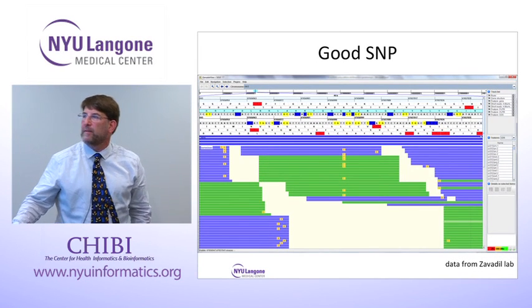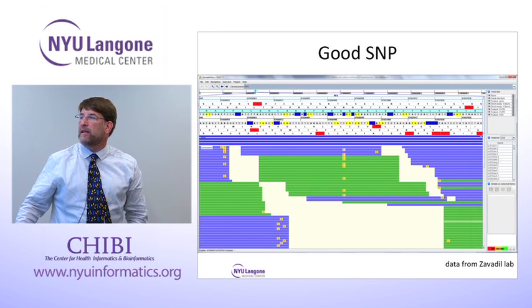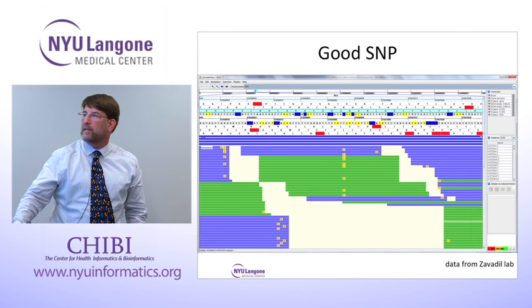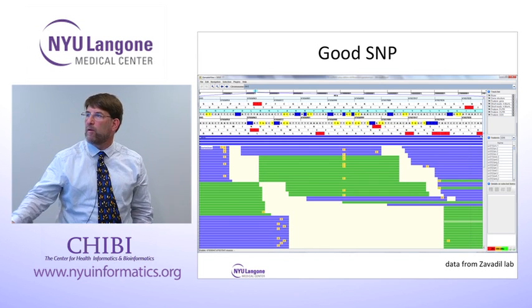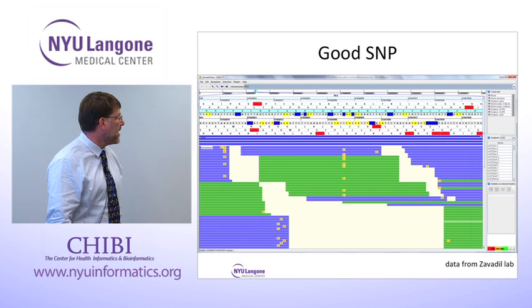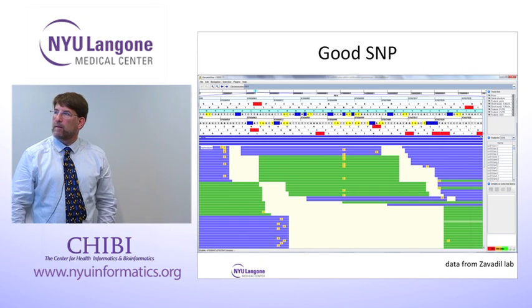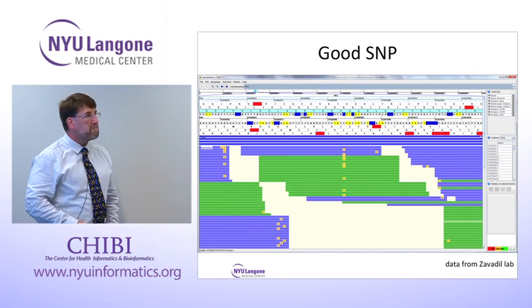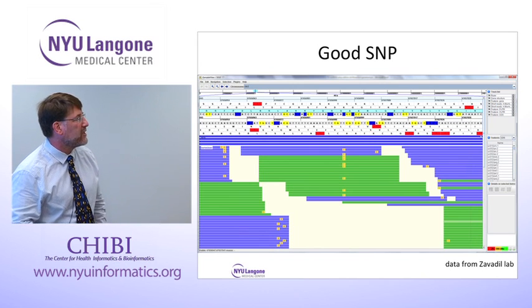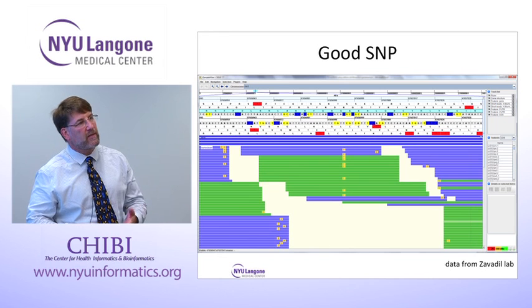Here's one that we think is real, a SNP that was detected by RNA-seq. The reason we think it's real, it's showing up in many reads that start in different positions. And it's showing up in good quality reads that don't have other mismatches. You expect them to be 50-50 when we describe SNPs? 50-50 mean directionally? No, owing to the expression from 2 chromosomes. So 50% allele frequency is a high likelihood. You don't have to be in all because that would be a homozygous mutation.